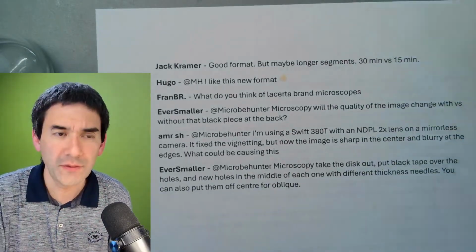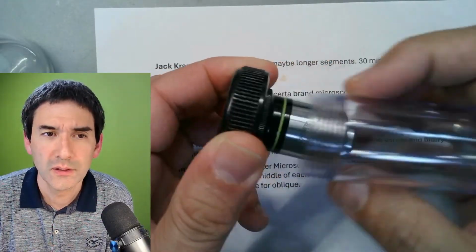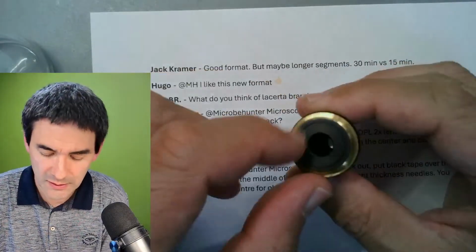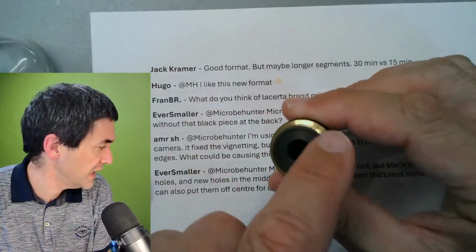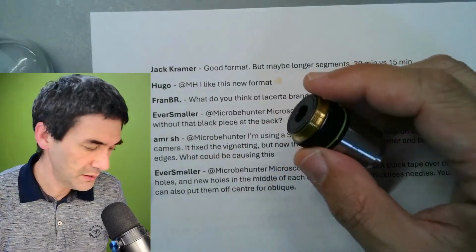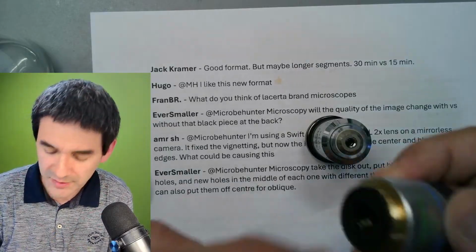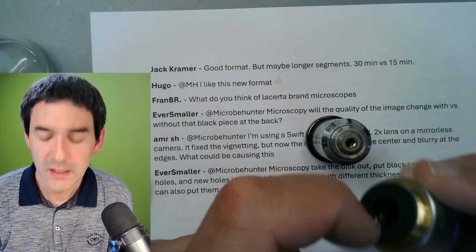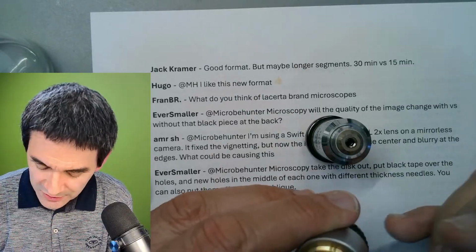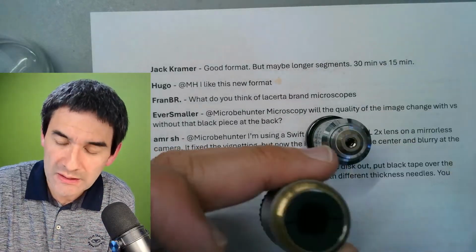Are you talking about this black piece here? Or are you referring to this? Some of the objectives had a plastic ring in there. I don't know about this one. This one over here is not a plastic ring, and this one also is not. I know that some of them had a removable plastic cap that you can take out.